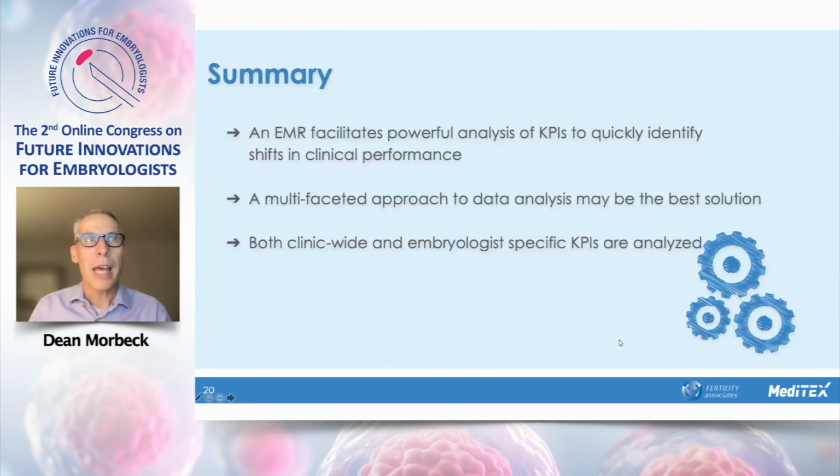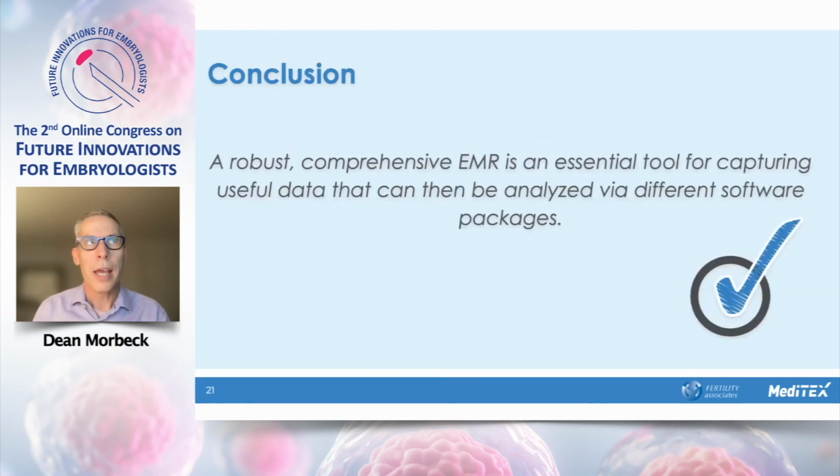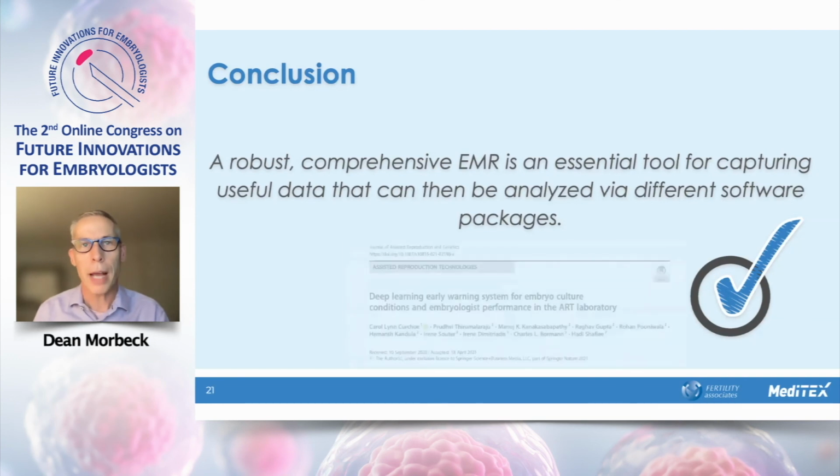In summary, an EMR facilitates powerful analysis of KPIs to quickly identify shifts in clinical performance, and a multifaceted approach to data analysis may be the best solution, both for clinic-wide and embryologist-specific KPIs. In conclusion, a robust, comprehensive EMR is an essential tool for capturing useful data that can then be analyzed via different software packages.